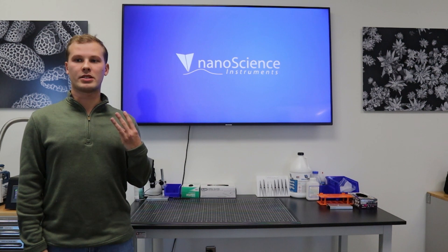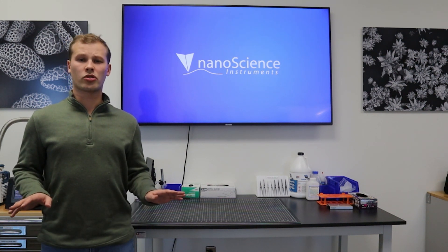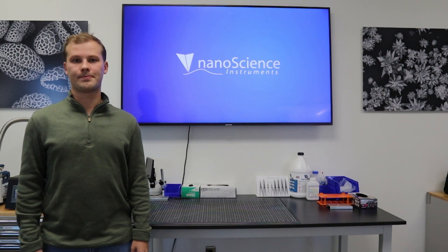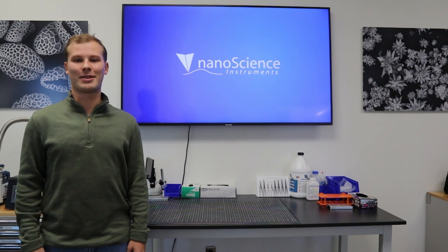This is the third in a series of videos detailing sample preparation, which is the most crucial part of any SEM analysis. Improper sample prep can impact the quality of imaging for our users, so be sure to employ the practices outlined in this series to ensure superb analysis with the Phenom SEM.